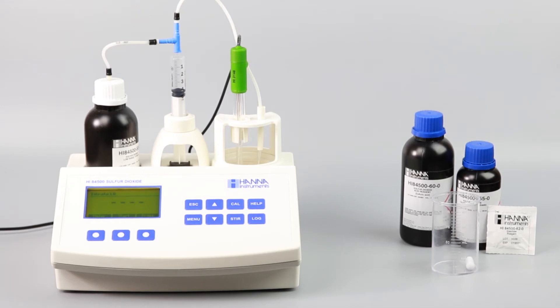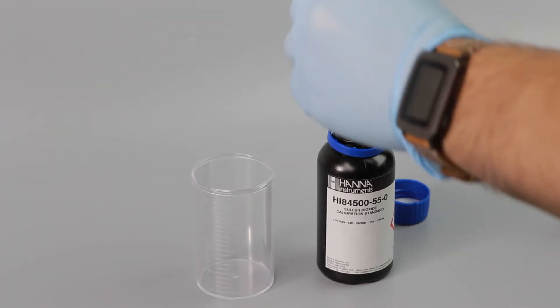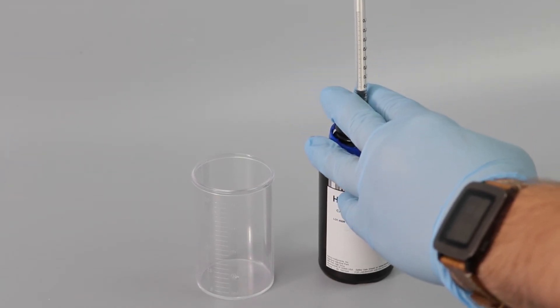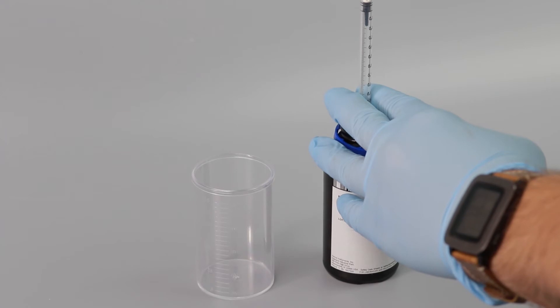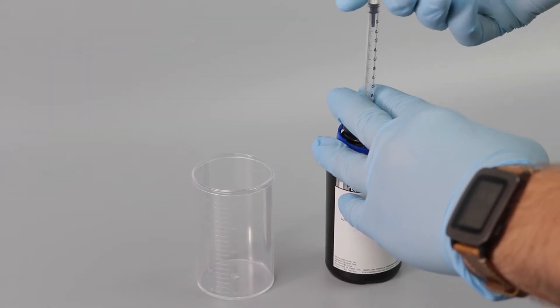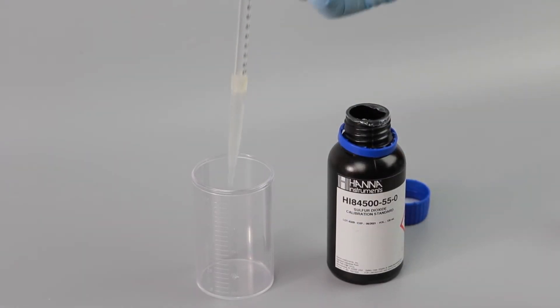To calibrate your titrator, start by preparing your sample. First, add your HI84500-55 pump calibration standard to a clean beaker. For low range, use 1 ml. Use 10 ml of standard for high range.